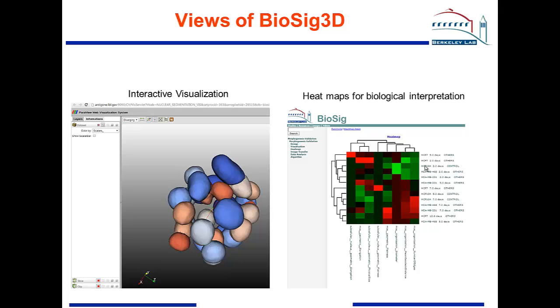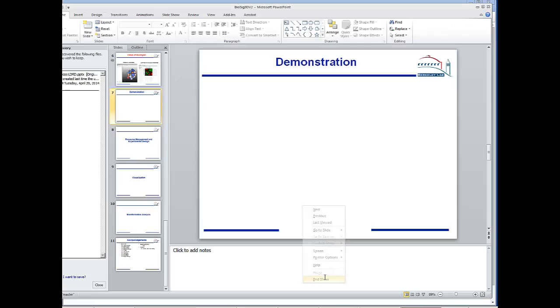So every row corresponds to a distinct set of experimental variables, and every column corresponds to an index that is computed as a result of morphometric property, molecular endpoint, or colony organization indices. With that, let me proceed with the live demonstration.